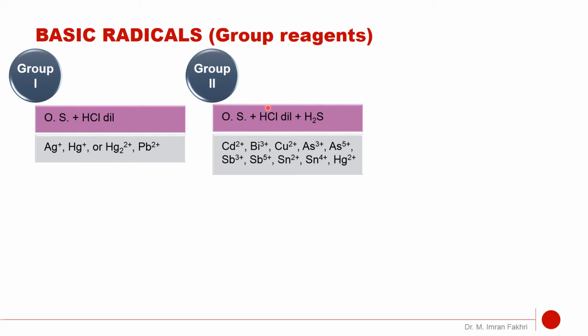In group number 2, we have to add dilute HCl in the original solution, and further we have to add hydrogen sulfide, H2S, in the gaseous state.